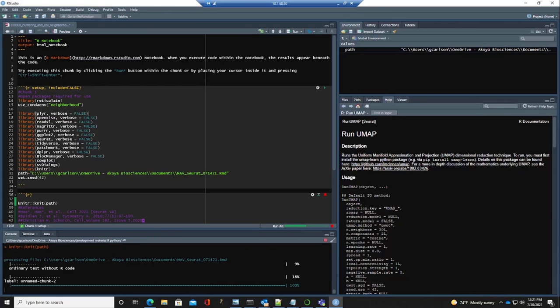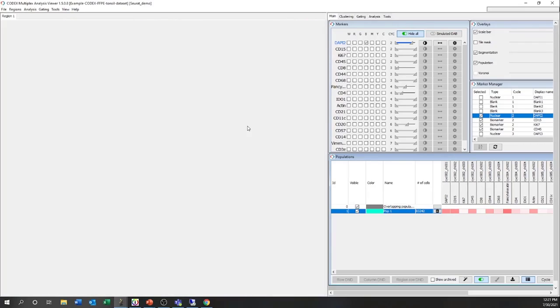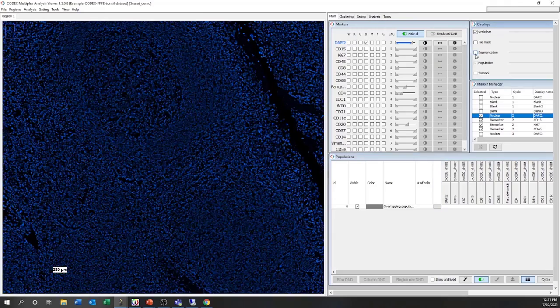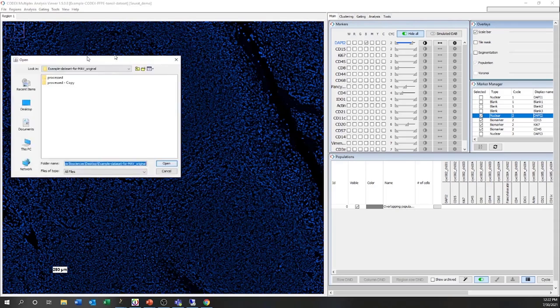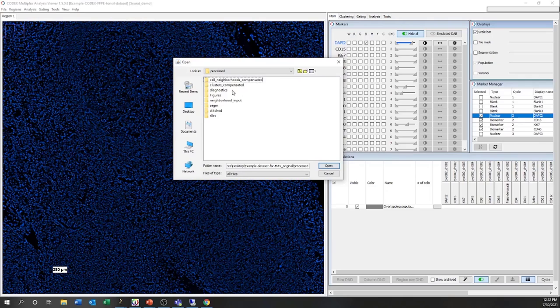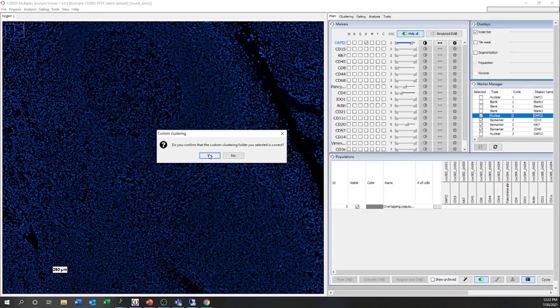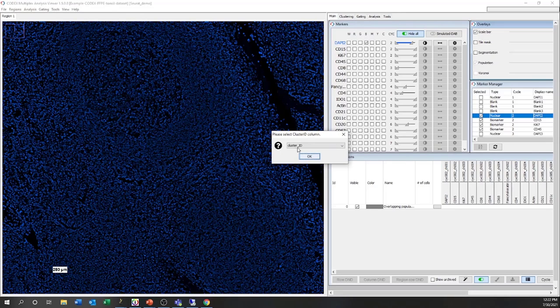We're going to spend most of the rest of our time inside of MAV importing those clusters. Let's go ahead — we don't need this population anymore, so we'll turn off the segmentation. Let's go to File, Import Clustering Run, navigate to the clustering run and select open. Let's confirm that the clustering folder is correct, and we'll choose Cluster ID as the correct column for where the cluster IDs are located.